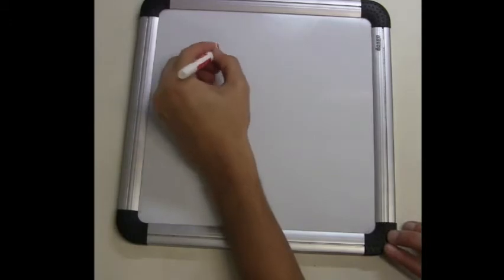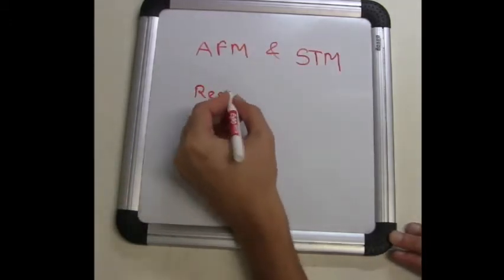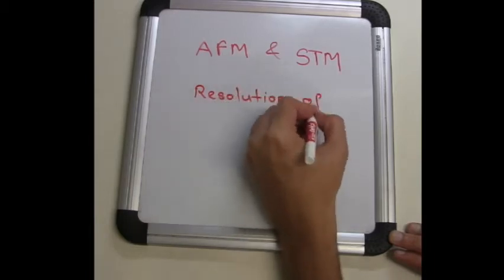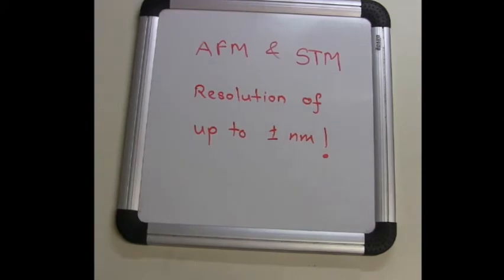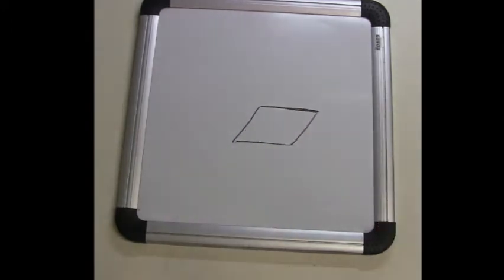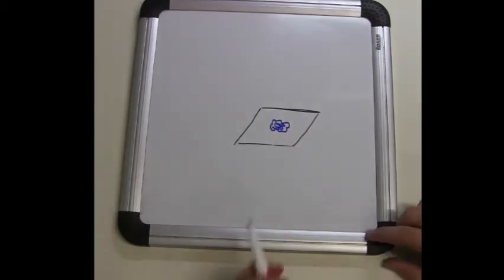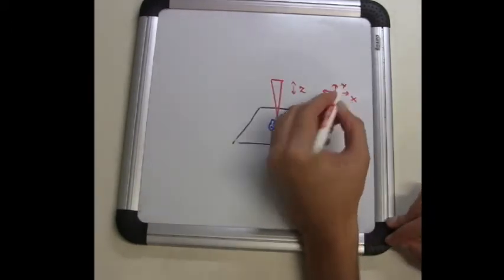To get past the diffraction limit, one can take help of techniques like atomic force microscopy or scanning tunneling microscopy, whose sharp scanning probes can achieve spatial resolutions down to a single nanometer. All this forms the basis of TERS. In essence, TERS involves a scanning probe microscope such as an AFM or STM, whose sharp tip is coated with a thin layer of silver or gold.